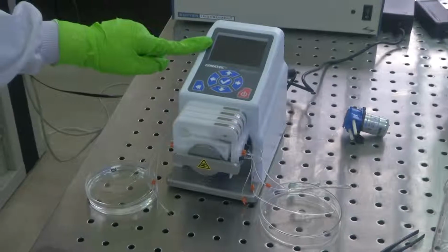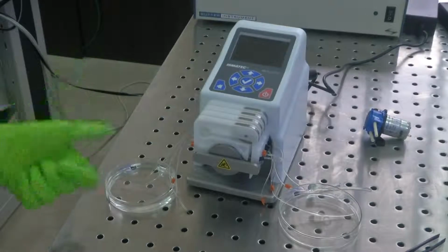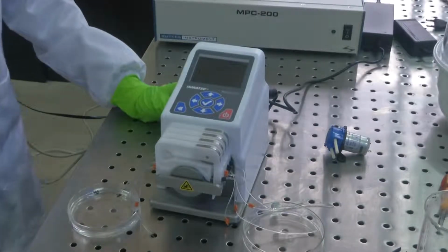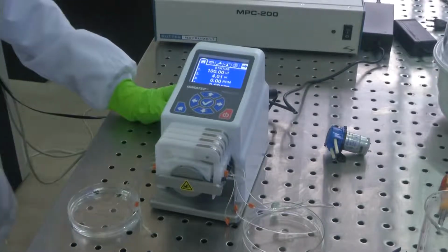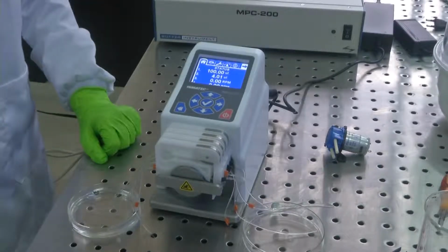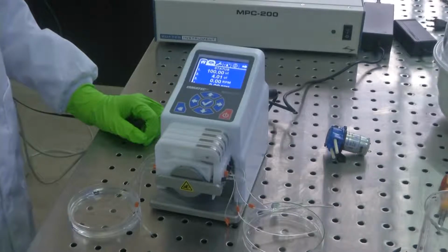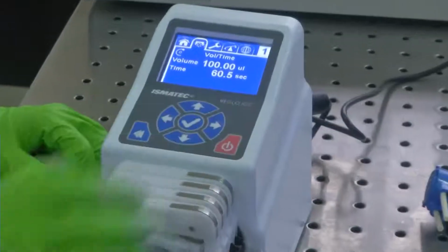As we can see, there is a digital display, a user interface, and let us see how to operate this pump. Say we turn on the pump. Now we know that there are 4 cassettes, 1, 2, 3 and 4 here, with 4 channels on one side. They are parallel channels. As you can see on the digital display, the first is the home, and the second talks about the configuration of the cassette. It tells how many microliters and the RPM at which it is running.